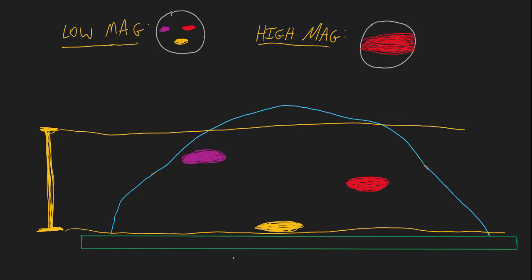Now, our depth of field, which is what both of these brackets are representing. Both of these represent our depth of field. Our depth of field is going to be much smaller. Now, only the section of the water droplet between these two red lines is going to be in focus.